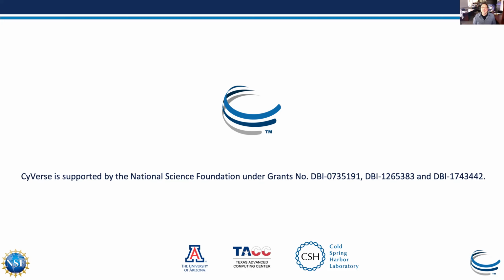But if ultimately your goal is just to get started, those web tools are fine, and you can make great images with those. So Circos or the related tools are definitely good to go. You'll see people using them, and then you'll want to make some yourself. They're beautiful, I have to say.